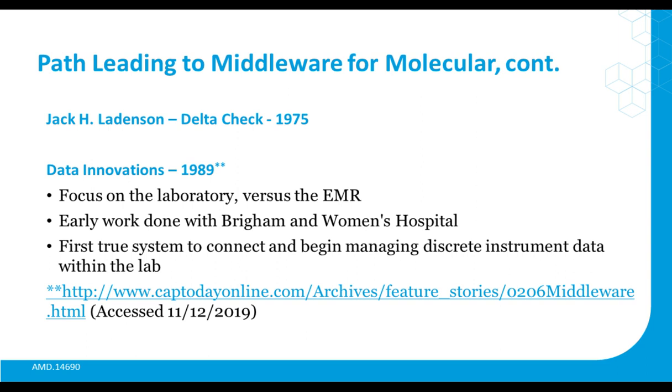So, I'm still on the history part, right? So this is the path leading to middleware. I've got to give credence to Dr. Jack Ladenson, who ironically is still on staff at Washington University Med Center in St. Louis. He's a professor of pathology and immunology. He came up with one of the first ideas of applying logic, which was the delta check.